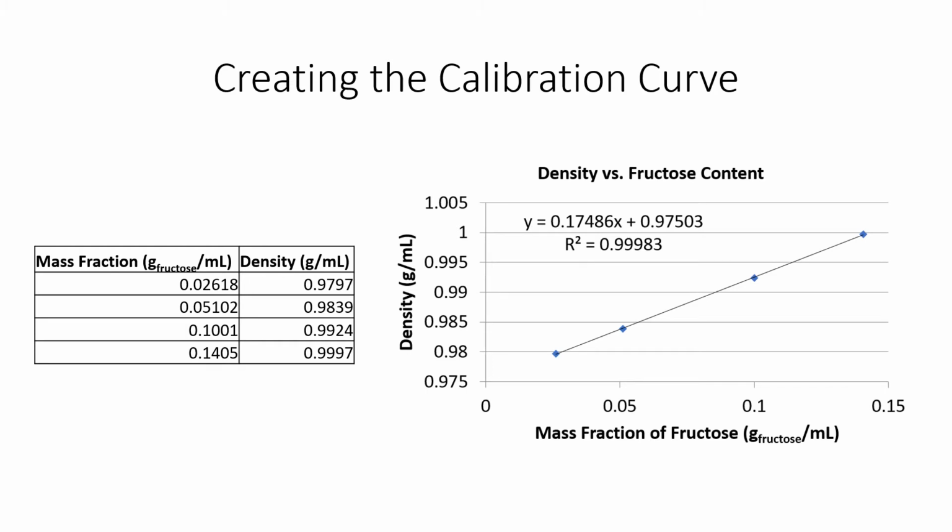Those values are the mass fractions of solutions A, B, C, and D, respectively.